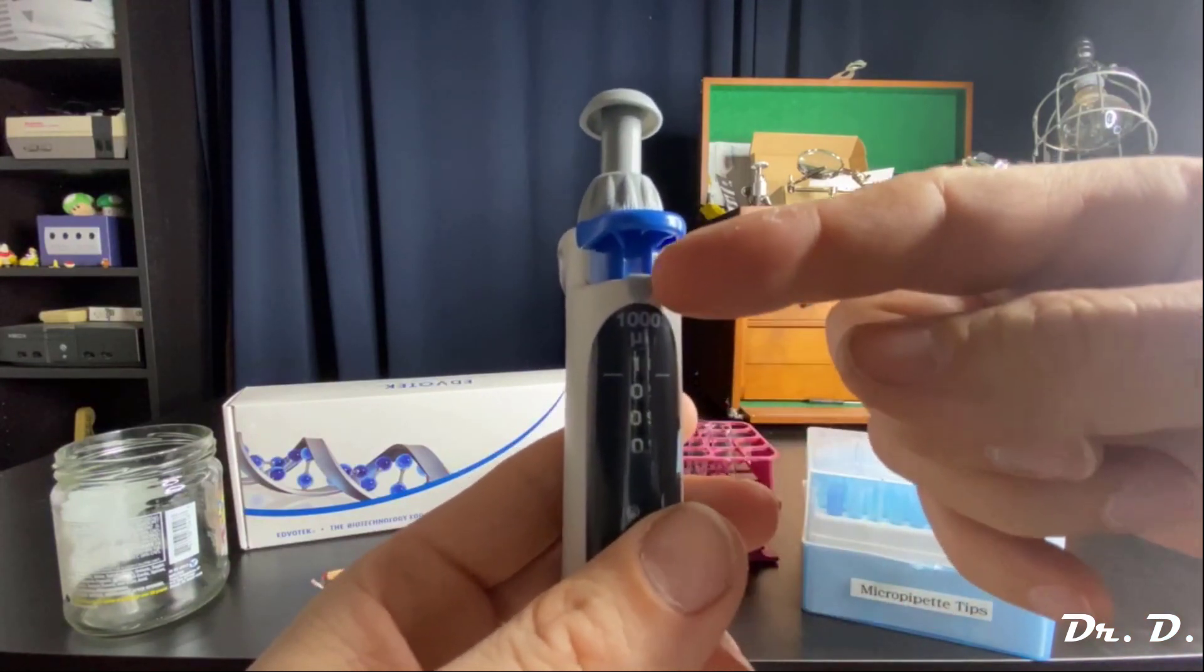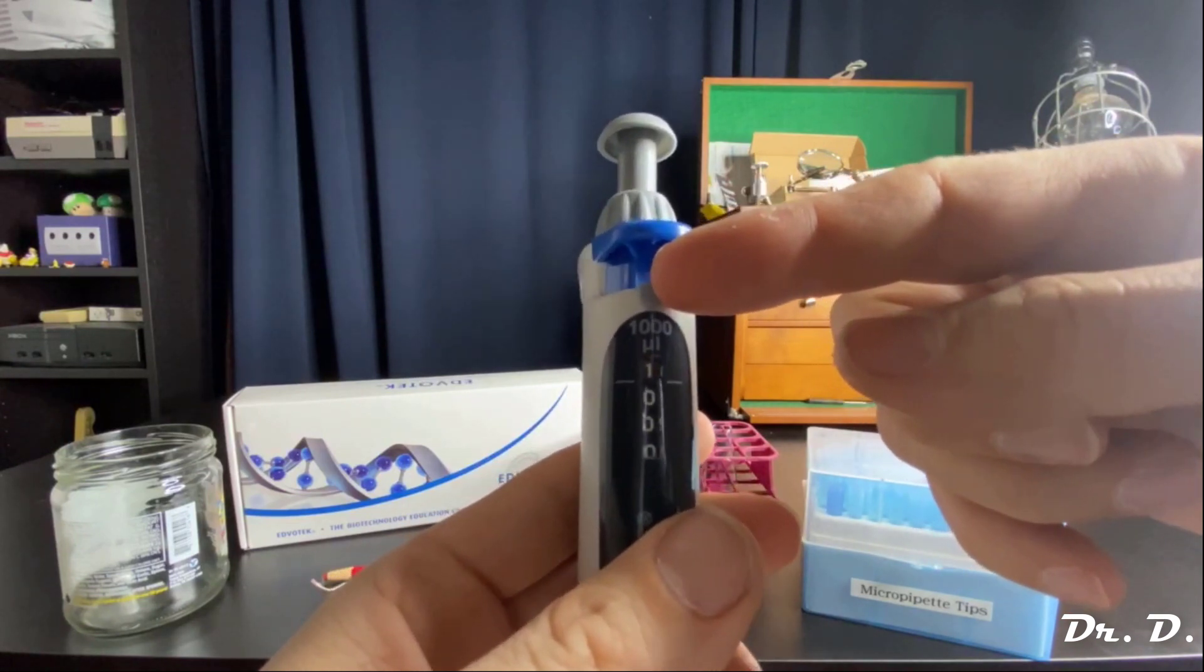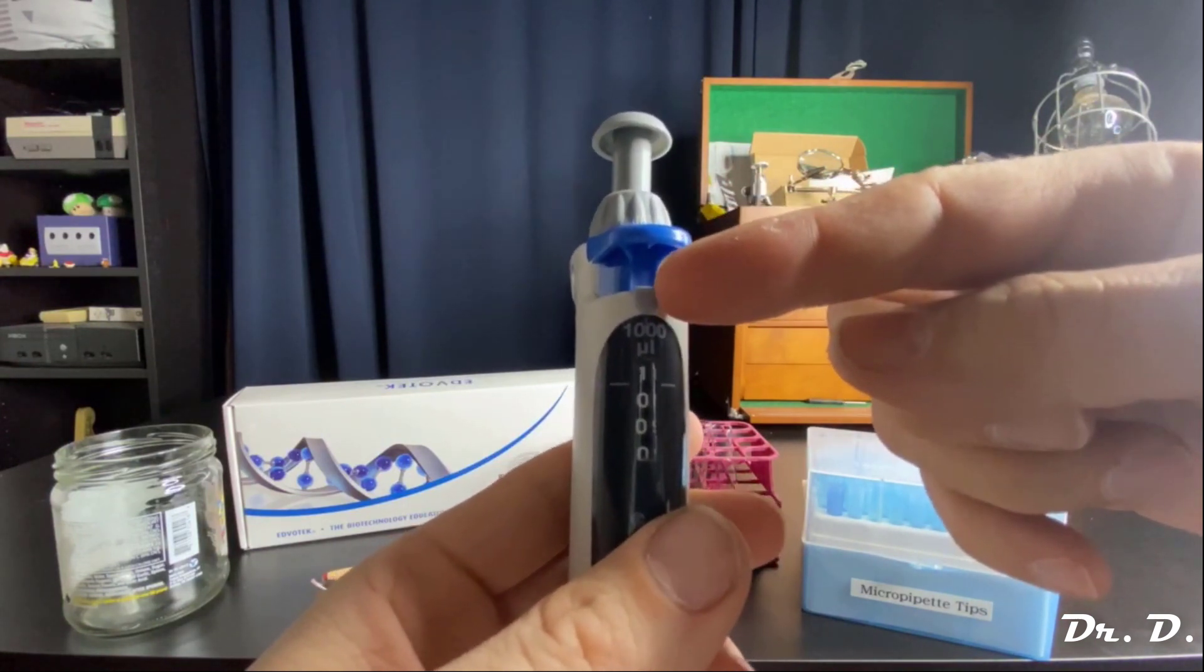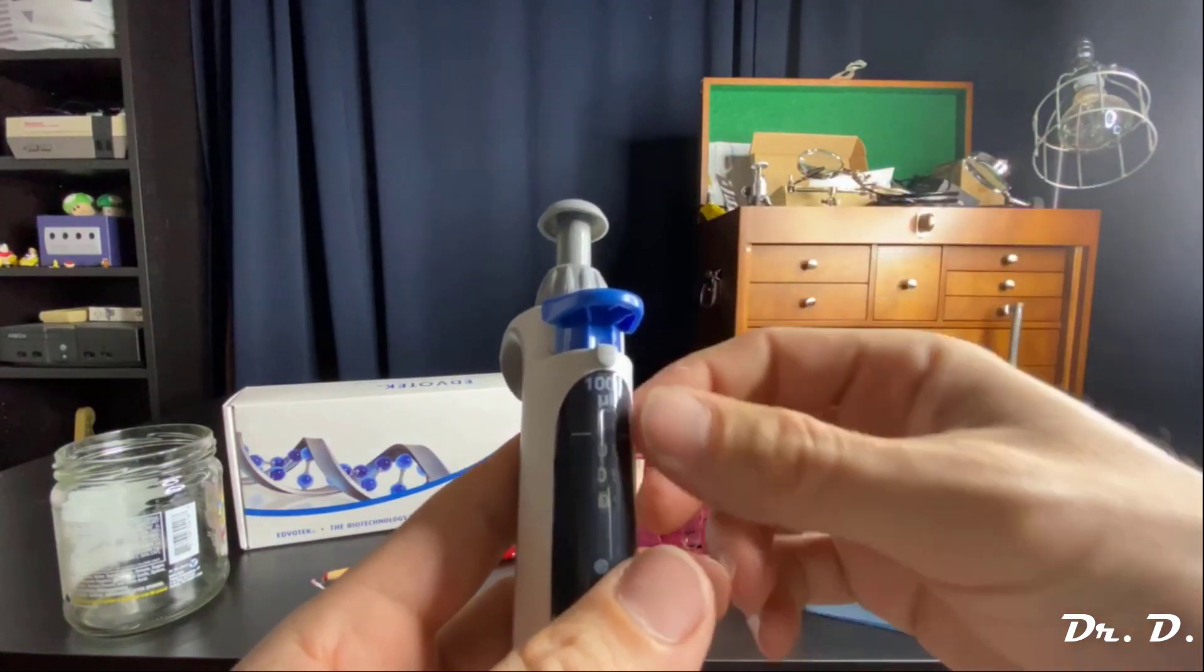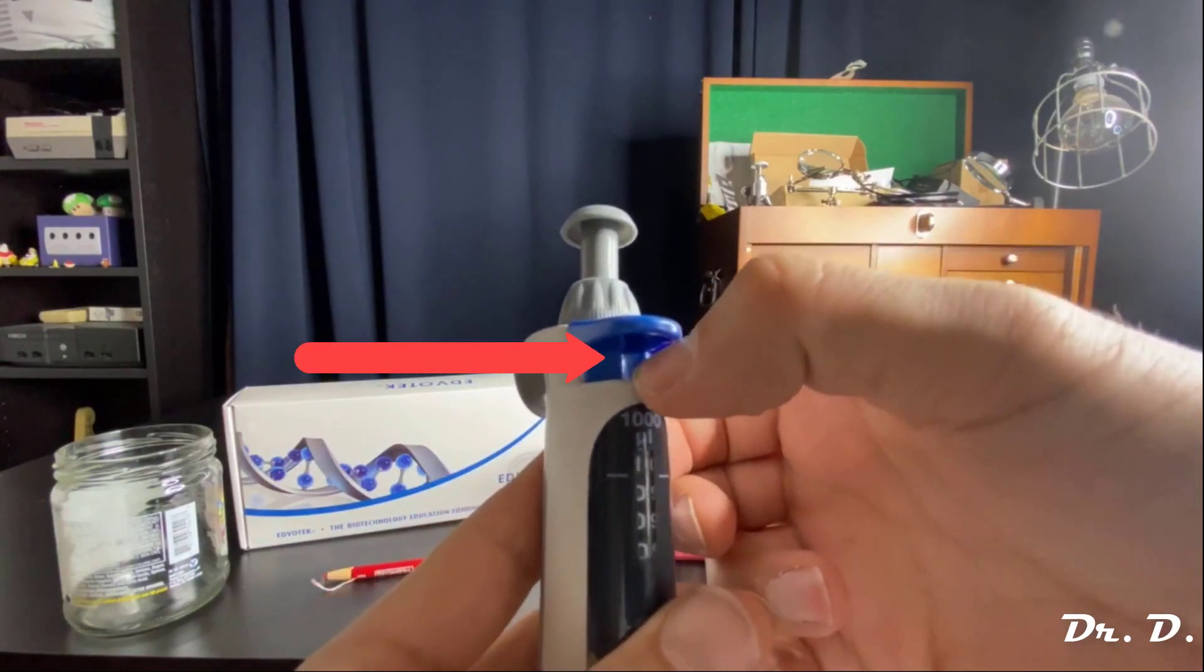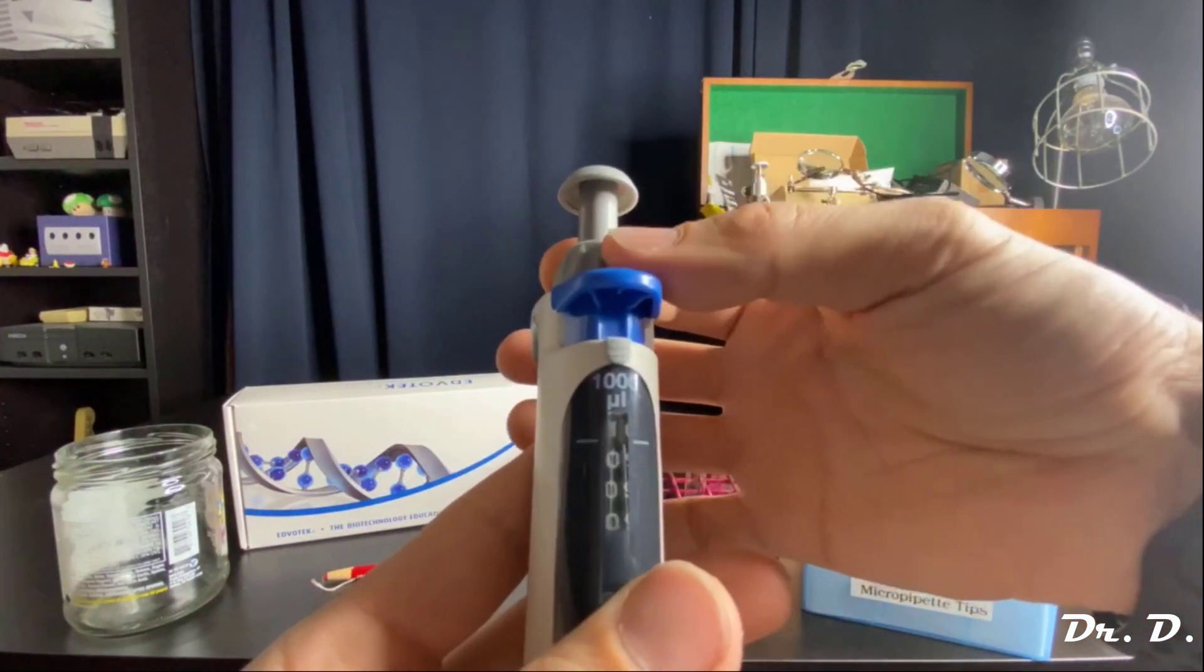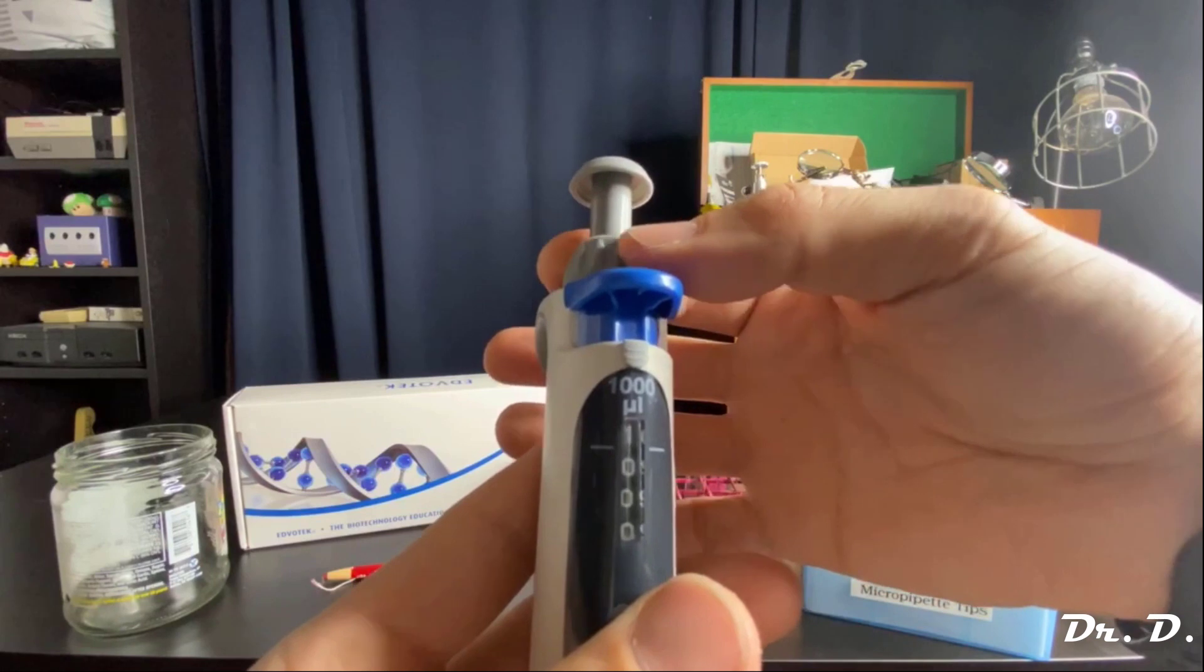This is something else that's kind of unique to these pipetmen. I have not seen this on other pipetmen, but you see this little gray dial right here. This little gray dial is a lock. So when you push that down, it locks the pipetmen. You see, now I can't turn my dial. That's a lock setting.